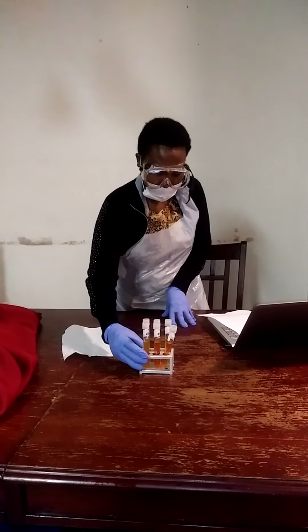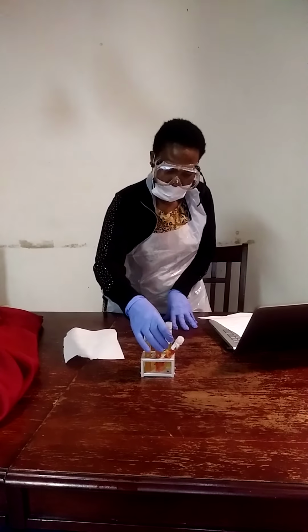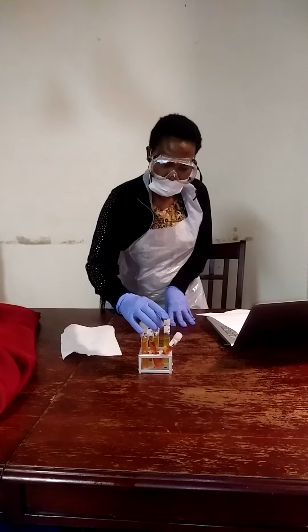And to my conclusion, I'm sorry, my rack is not holding these test tubes, they are sliding.